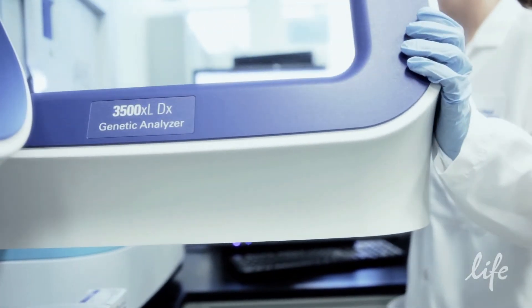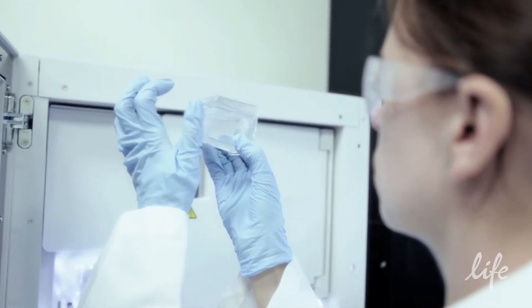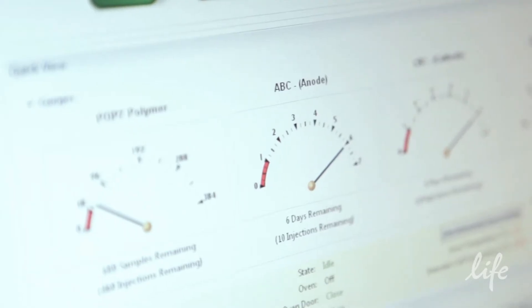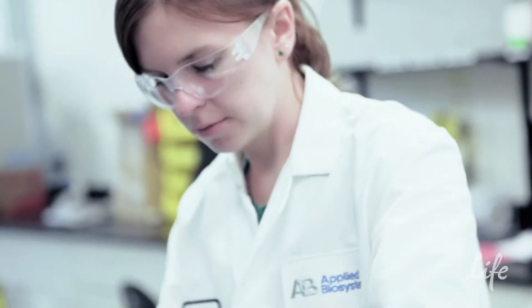The mission of the quality control lab is to test our polymer under the same conditions you experience every day. This means having every type of genetic analyzer on hand so we can stand behind our polymer's performance when it arrives in your lab.